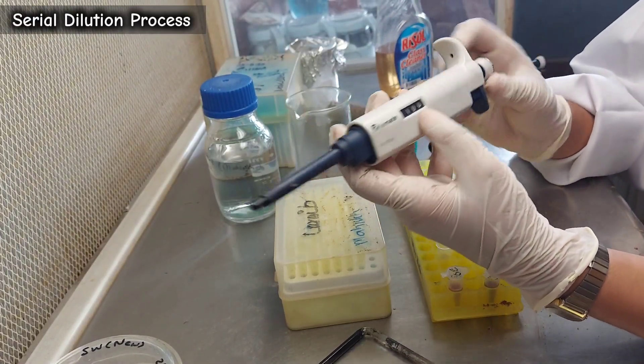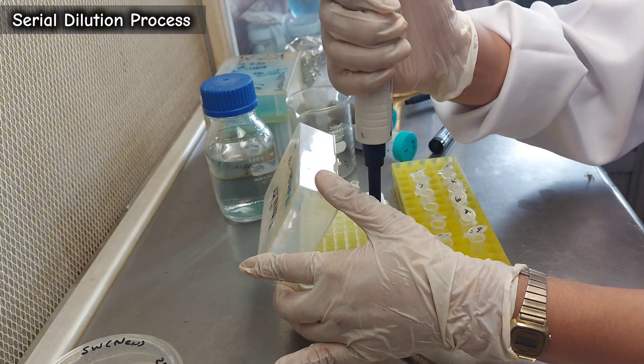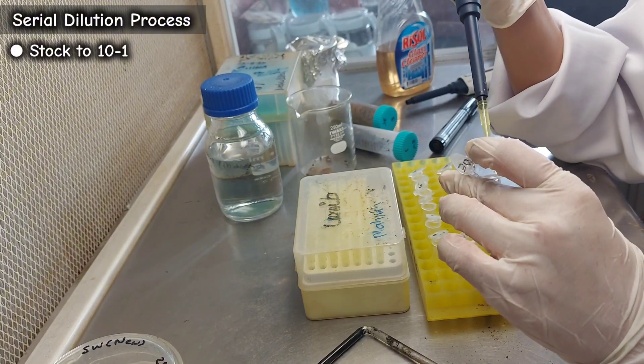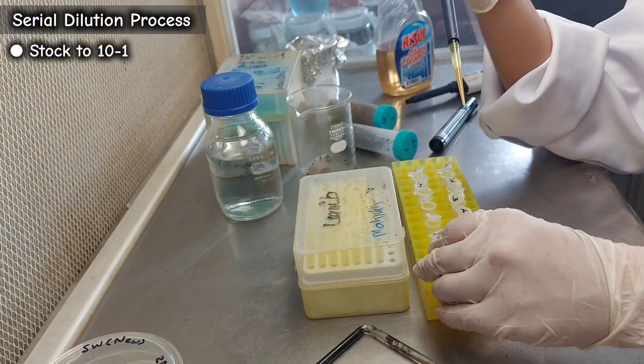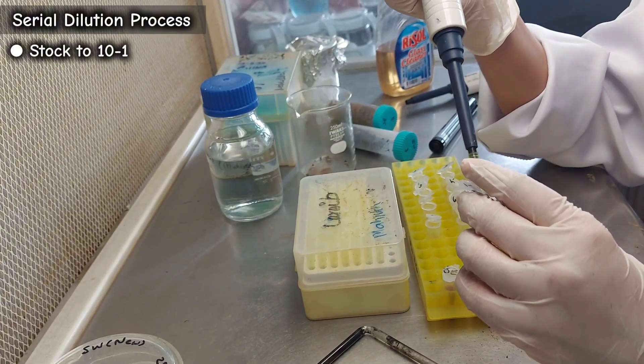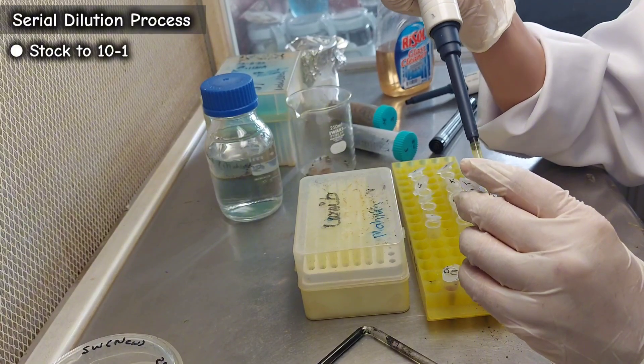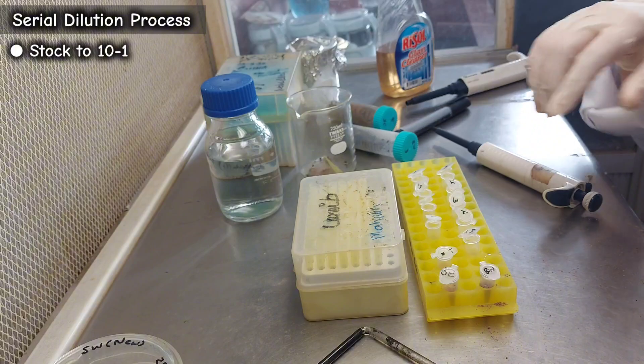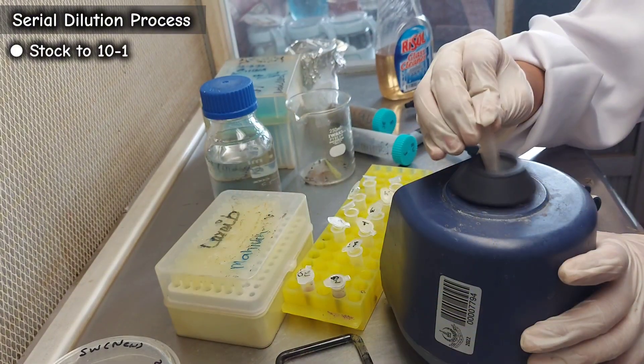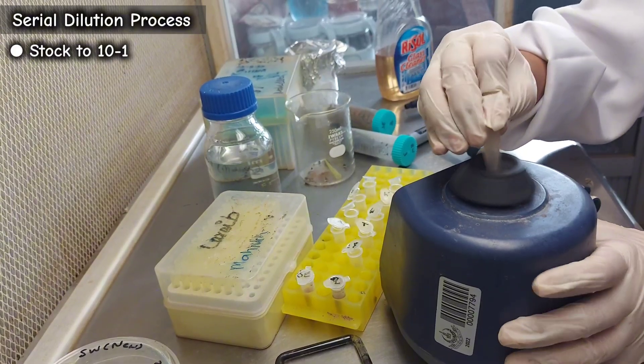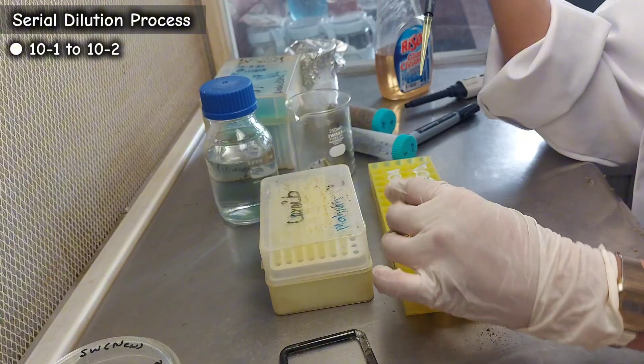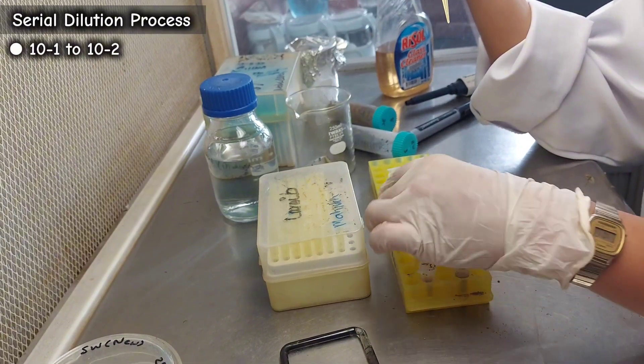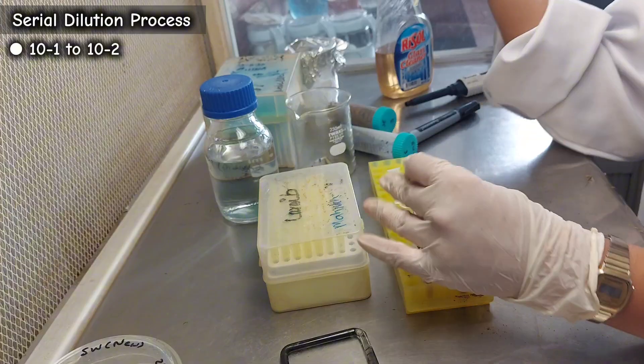After vortexing the stock sample, pipette out 100 microliters from the stock tube and transfer it into the first dilution tube labeled 10 to the power of negative 1. Mix the tube thoroughly by vortex. From the 10 to the power of negative 1 tube, transfer 100 microliters into the 10 to the power of negative 2 tube. Repeat this process up to the last dilution tube, ensuring proper mixing at each step.